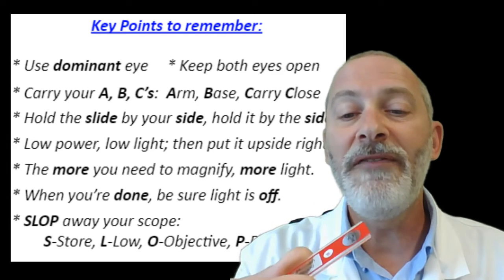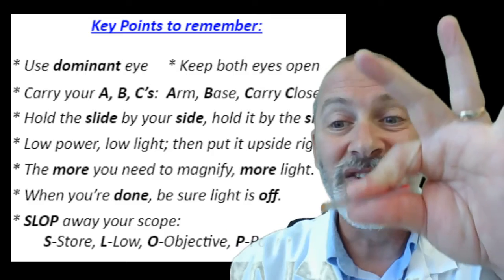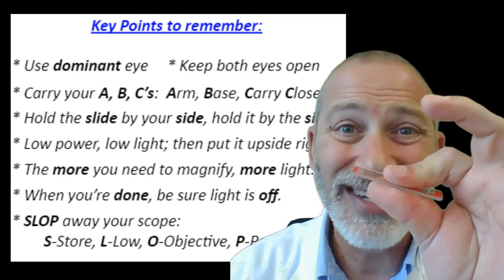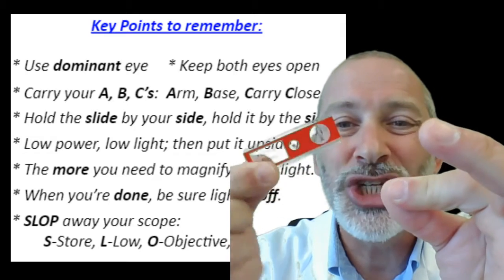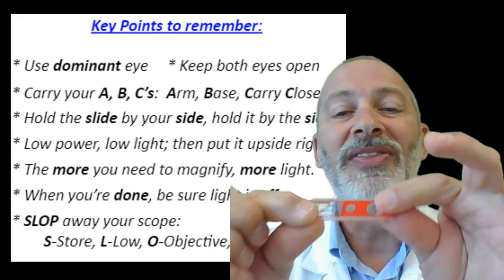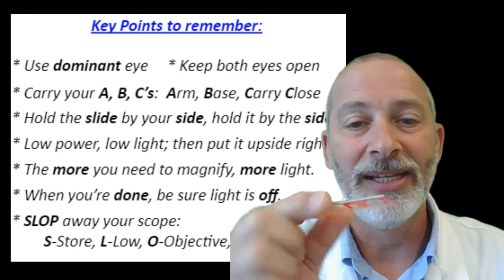So don't ever, I'm going to show you what not to do. Don't ever grab a slide like this. No, no, no, that's not good because you're smudging it all up. Always hold it by the sides and the side of the slide.